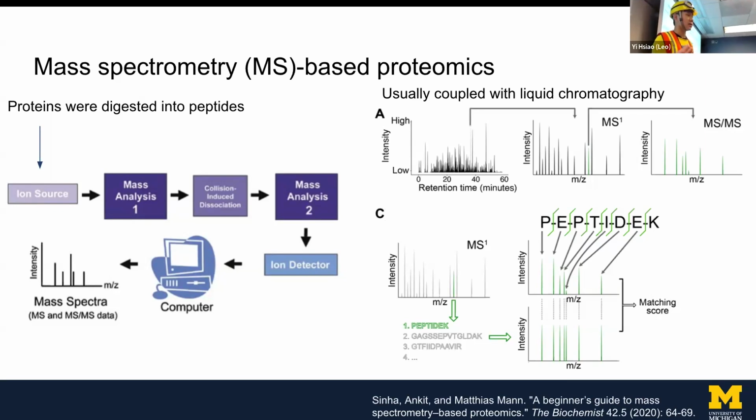I think that's an even older technique compared to what some people can do, like single cell, and use antibodies to profile the protein composition. But in that strategy, I think right now the throughput is still like 2,000, 3,000 proteins at one time. But with mass spec, generally we can get like 10,000, and that's like the lower limit you can get.